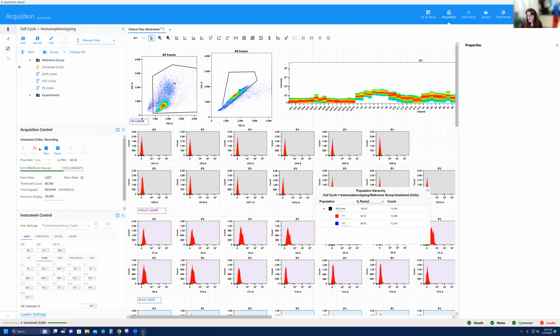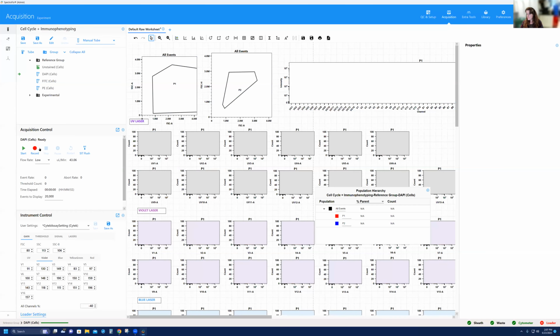Exactly. And I'll just point out that one thing I want to be mindful of is, for CD4, for example, we see that on monocytes, not just lymphocytes, right? So in this scenario, monocytes are CD4 moderate, and the lymphocytes are going to be brighter for CD4. But if I was unsure about expression of populations, and I gated in a certain area and something's off scale, I need to know about that so I can adjust my gains appropriately. So in this initial setup I like to keep things a little bit more broad to make sure I'm not going to regret my choices after the run.